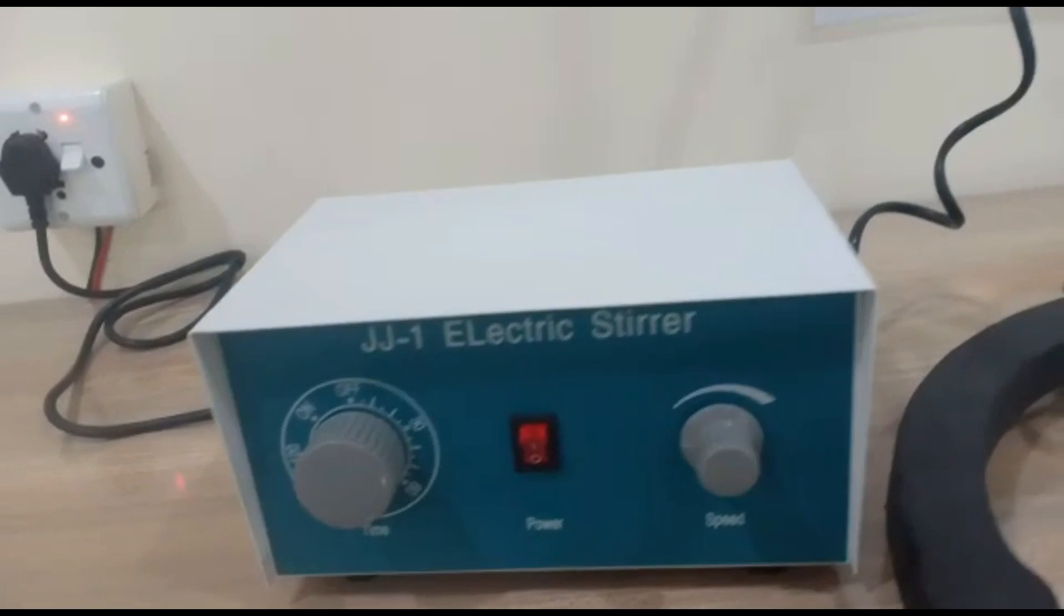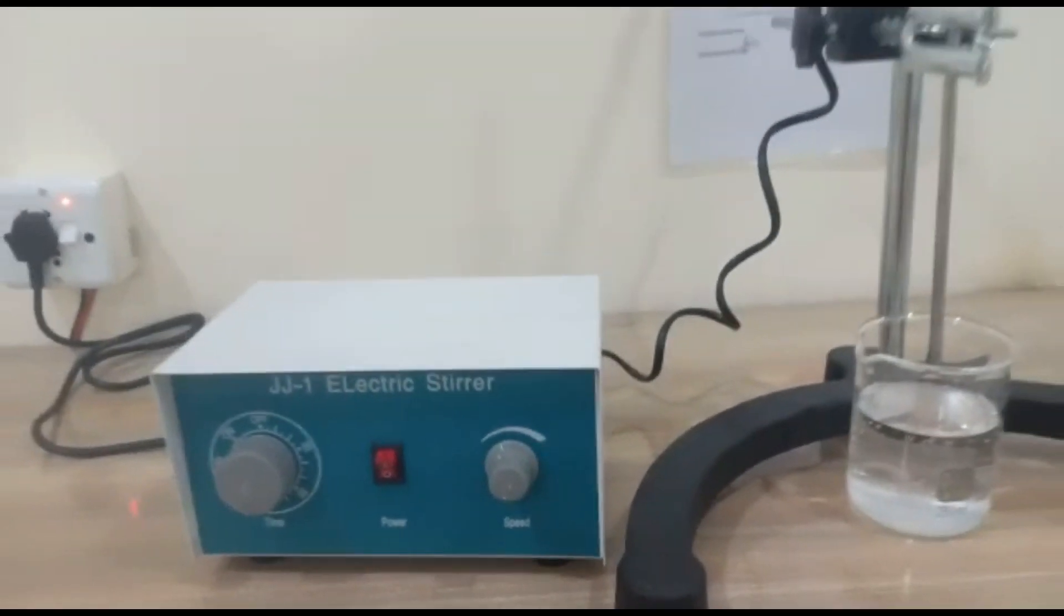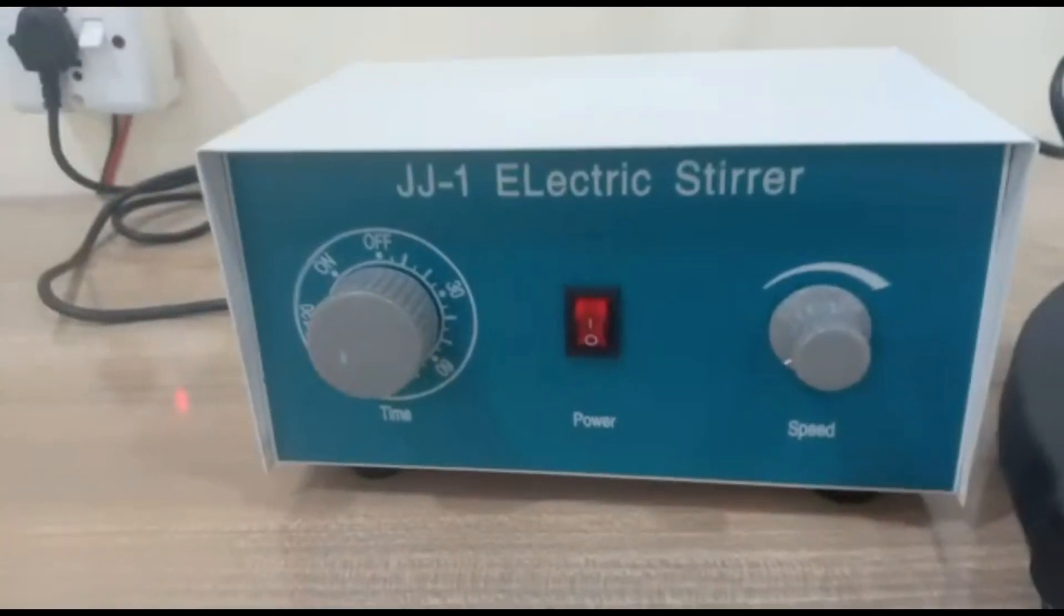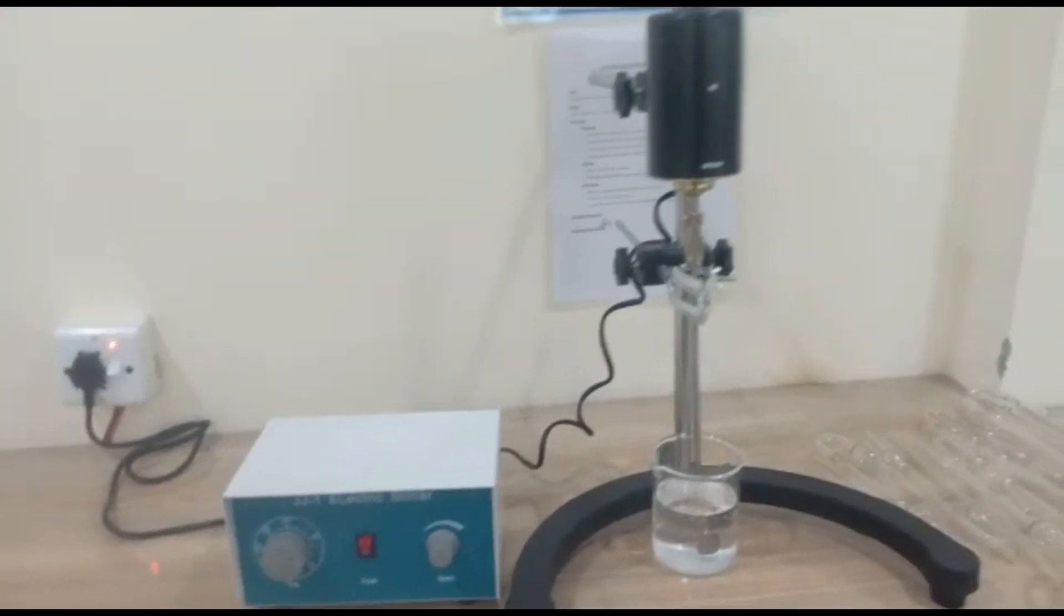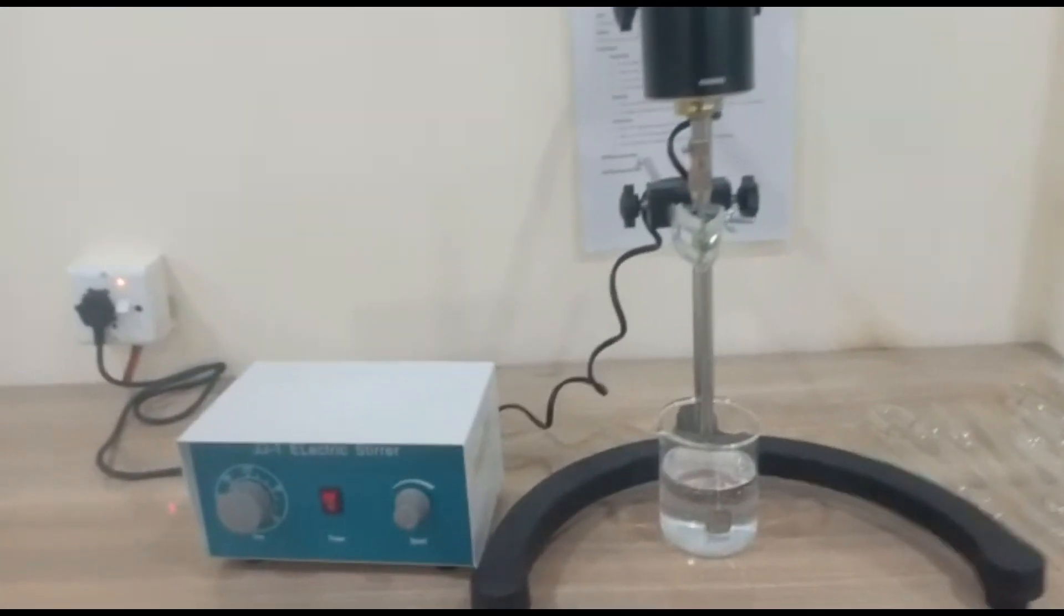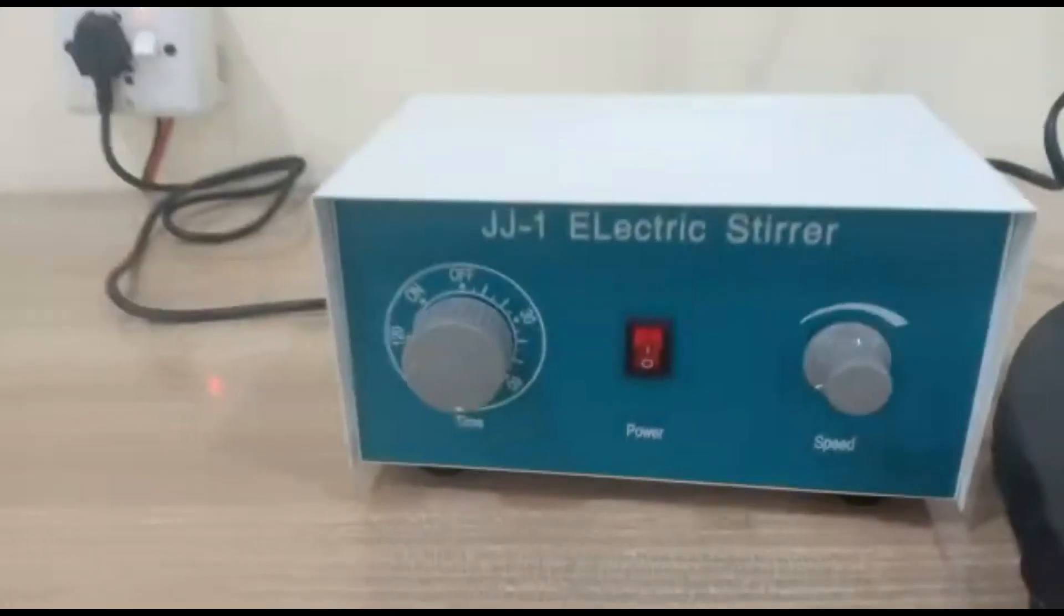Basically, we have two instruments. You will see that it is a motor where we control speed, and it is an assembly. We will basically rotate it. We utilize it for stirring purpose.